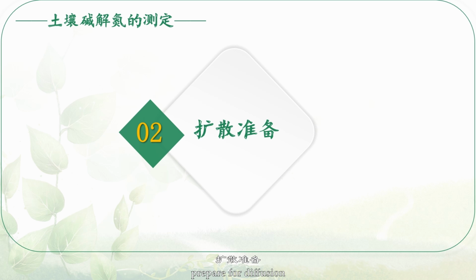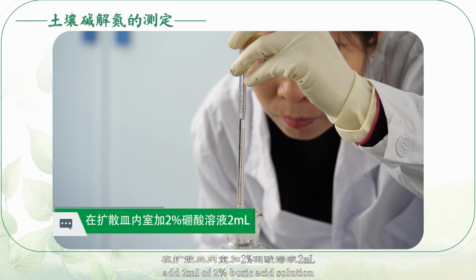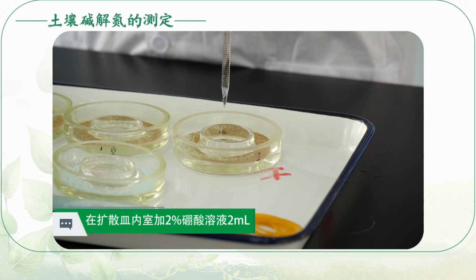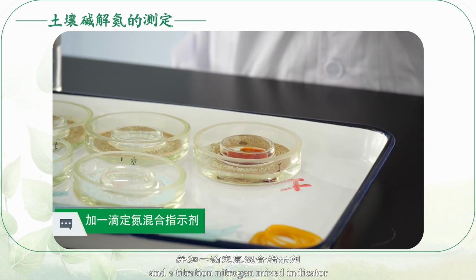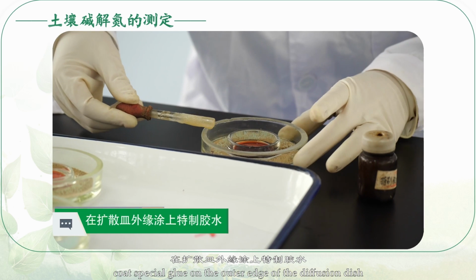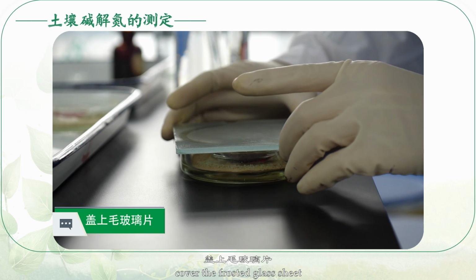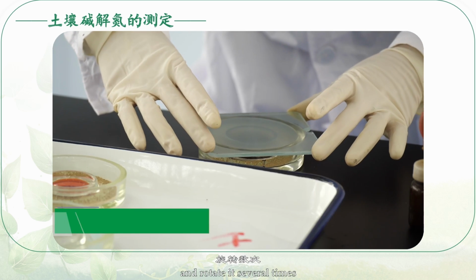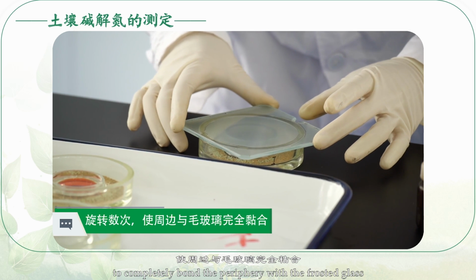Prepare for diffusion. Add 2 milliliters of 2% boric acid solution and a drop of nitrogen mixed indicator in the inner chamber of the diffusion dish. Coat special glue on the outer edge of the diffusion dish. Cover the frosted glass sheet and rotate it several times to completely bond the periphery with the frosted glass.